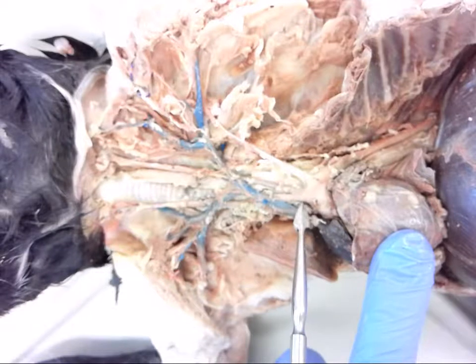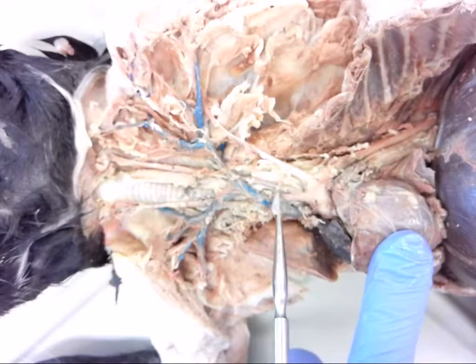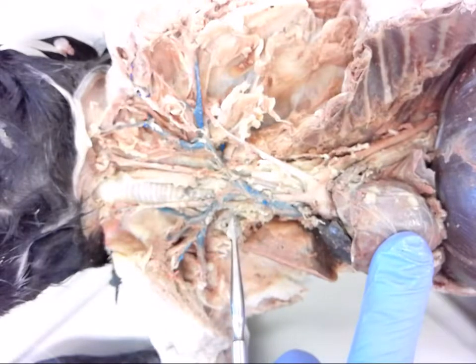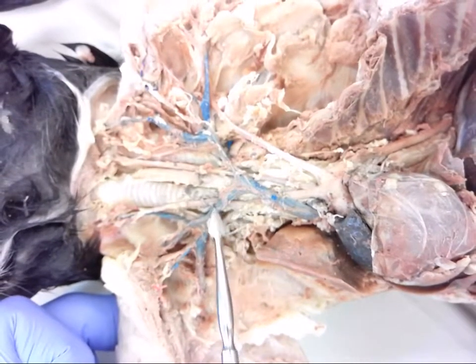Off of that, your two branches are your brachiocephalic and your left subclavian. The brachiocephalic is going to branch here prematurely into the left common carotid, and then a little bit higher up here we will have the right subclavian and the right common carotid.